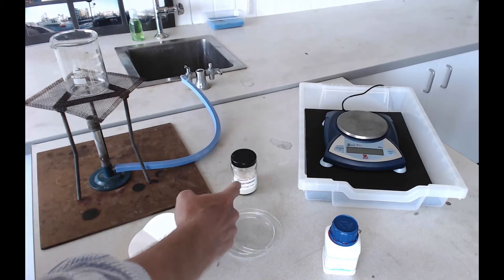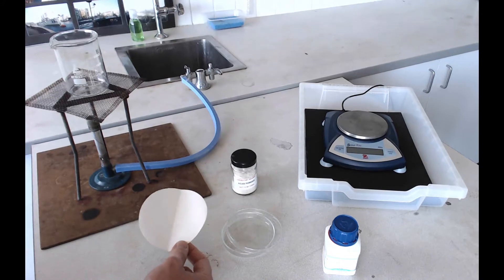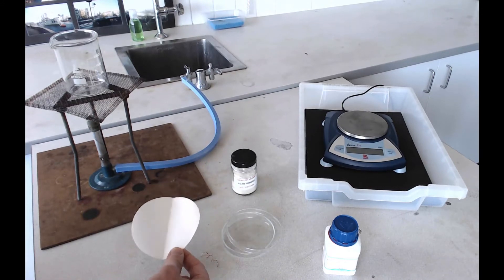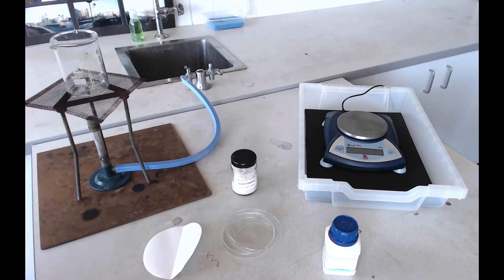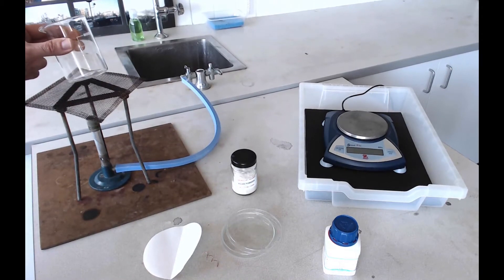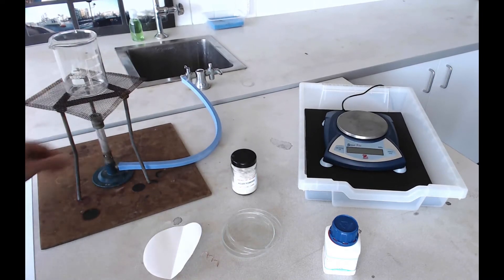You'll need some agar powder, a balance to weigh out your solids, a piece of filter paper to weigh your solids onto, a heat mat, a tripod, a gauze, a 250ml beaker for making your solution, and a Bunsen burner because the agar does not dissolve very well in cold water.